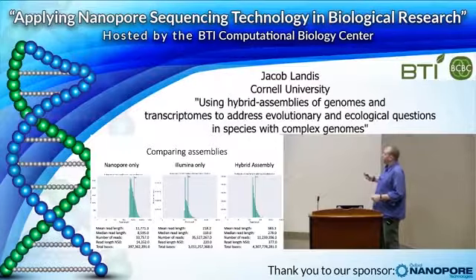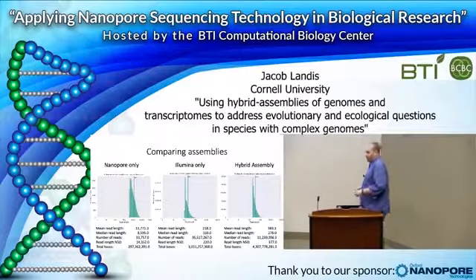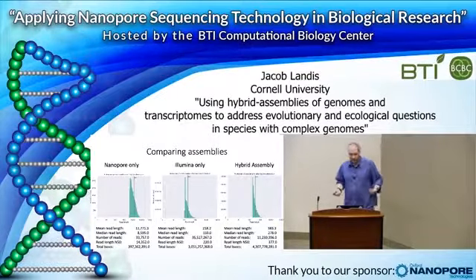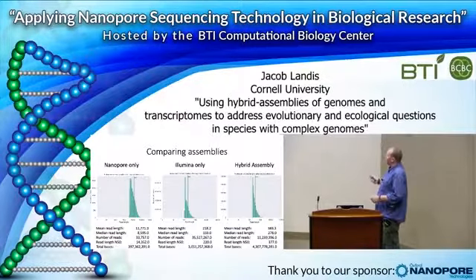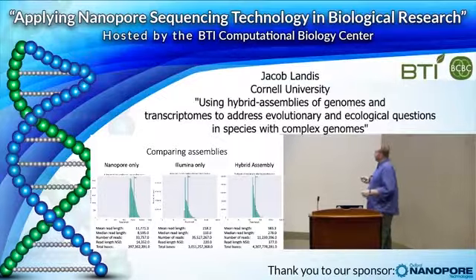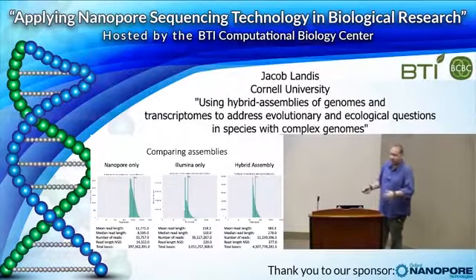So with just the long reads, again, we didn't have much, but we had an N50 of 14,000. We had 33,000 contigs, but we were only assembling about 400 megabases of the genome, so about the size of rice. So we're missing a ton of things here. You take just the Illumina data, we have now 35 million reads, or contigs, but we're assembling about 3 gigabases. So we're starting to move there. The N50s are very low.